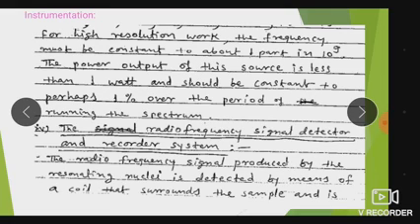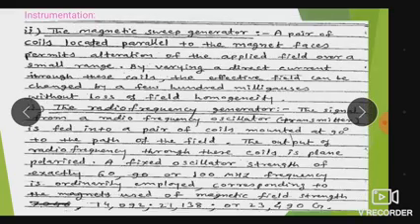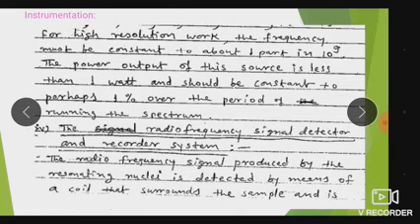The power output of this source is less than 1 watt and should be constant to perhaps 1% over the period of running the spectrum. So, what is the use of this? The use of that radio frequency generator is to get the resolved spectrum.